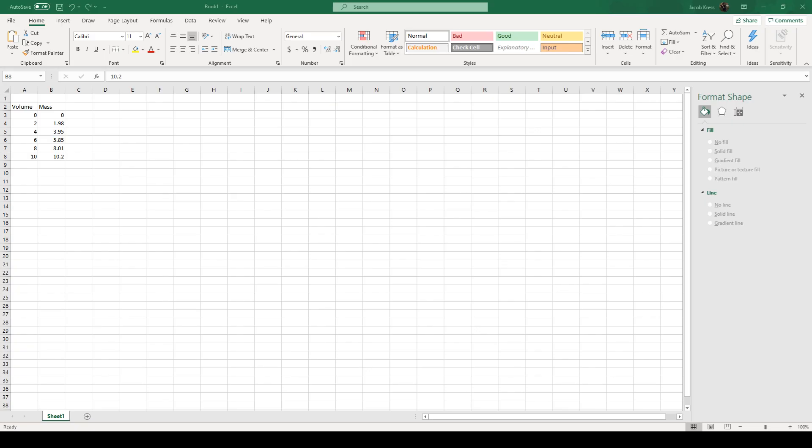So obviously for the post lab, you guys are going to have to make those charts to be able to get the slopes to be able to calculate the density for the water, the alcohol, and the mixture. So I'm going to show you guys how you would do that in Excel.